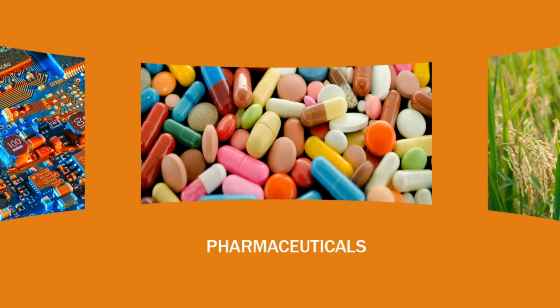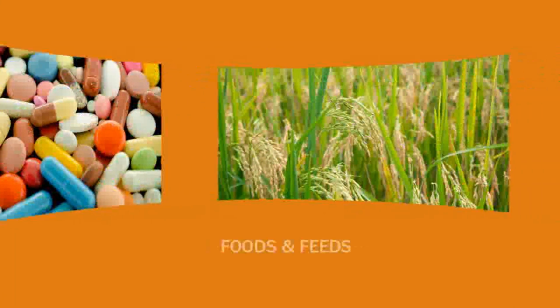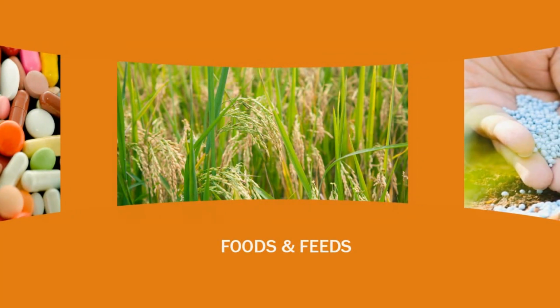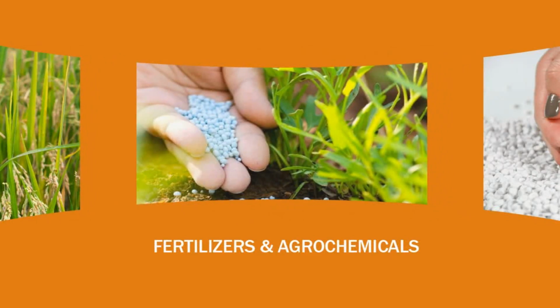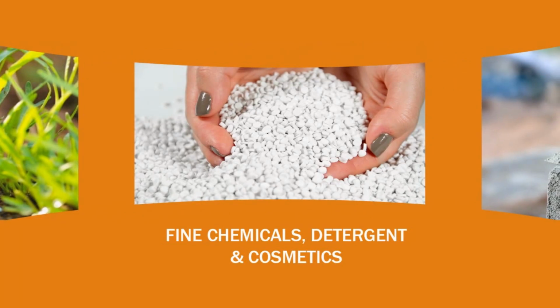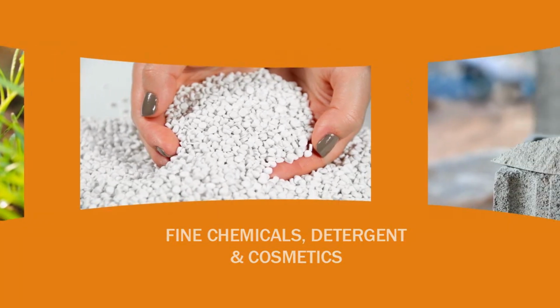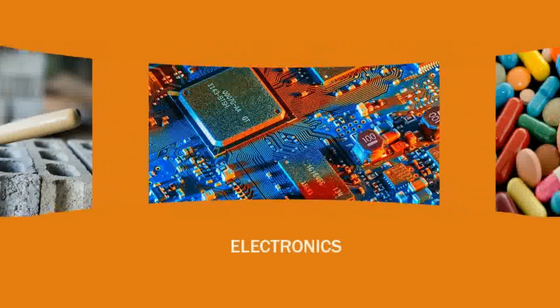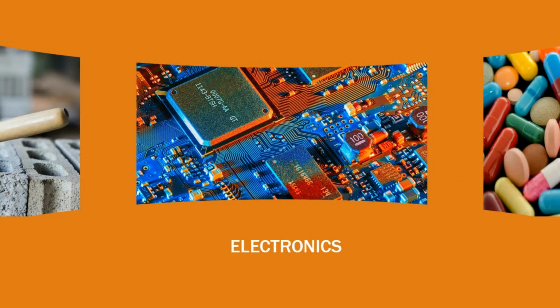Application of the method: pharmaceuticals, foods and feeds, fertilizer and agrochemicals, fine chemicals, detergent and cosmetics, building materials, electronics.